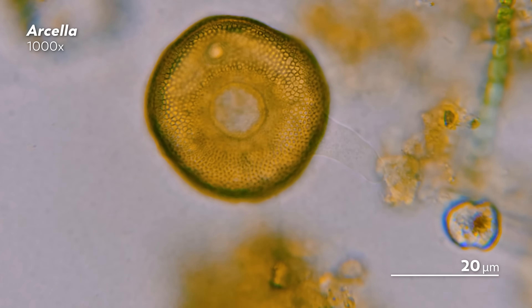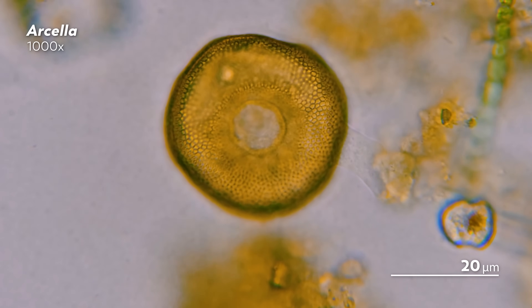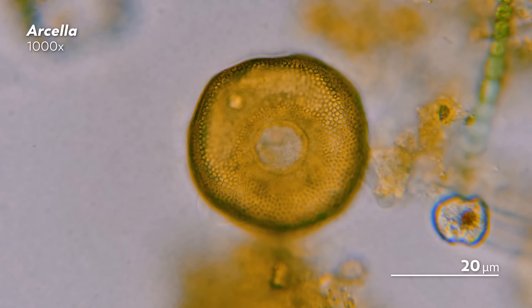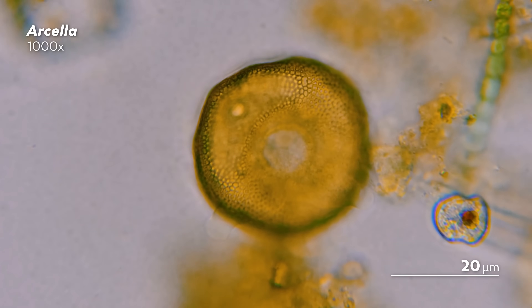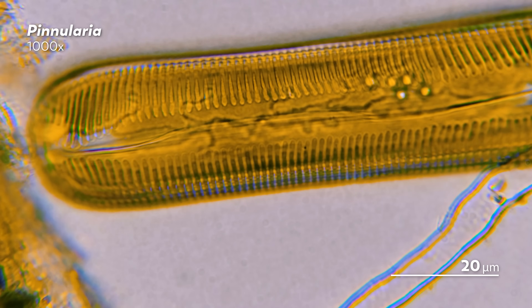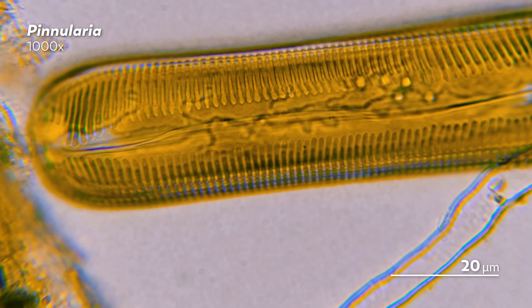We have a whole video explaining oil immersion and how it helps you see up close and personal with some of the most spectacular organisms. But one thing to know is that you need to be careful — not all objectives can work with oil immersion, and if you use the wrong one, you might actually ruin it. This technique relies on high magnification objectives, so you'll need to be careful not to move too quickly. If you're not careful, you can cause your objective to crash into the slide, which can break the slide, but also, more importantly, can damage the objective.